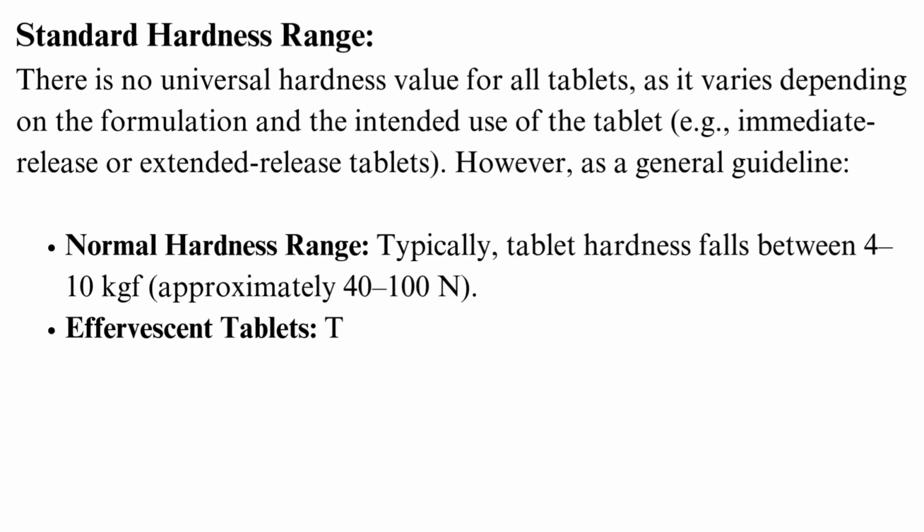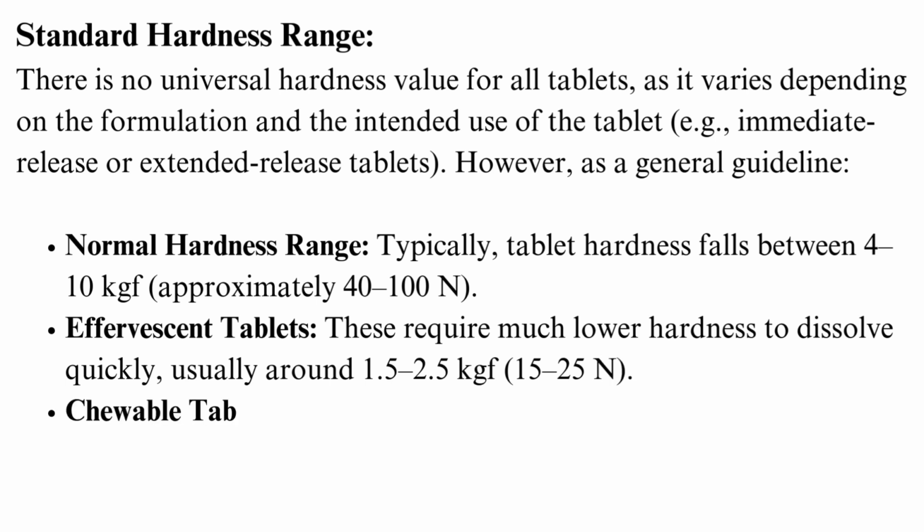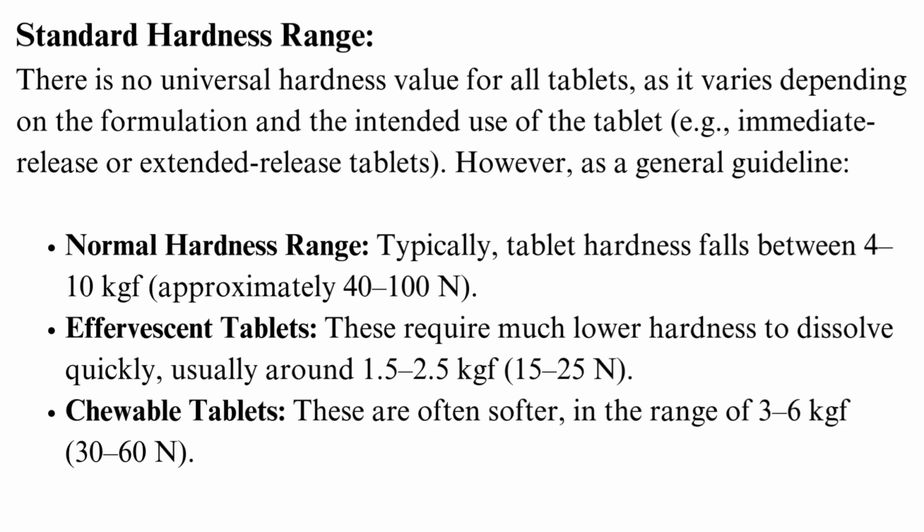Effervescent tablets require much lower hardness to dissolve quickly, usually around 1.5 to 2.5 kgf. Chewable tablets are often softer, in the range of 3 to 6 kgf.